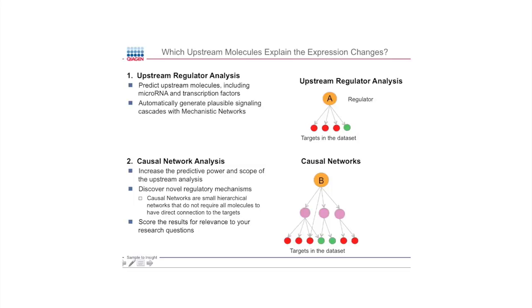And because it can be complicated, there can be a lot of different regulators predicted, we allow you to ask the question: does B have a known connection to some phenotype or something of interest, like another gene? To help you sort and prioritize the regulators that come out, these Bs, or these upstream master regulators as we call them, you can put in a function to score against.